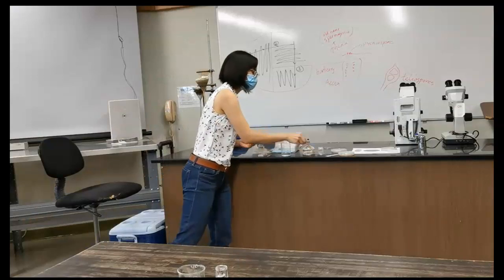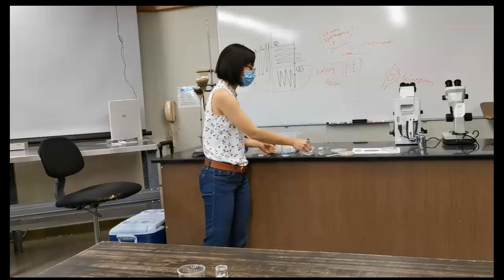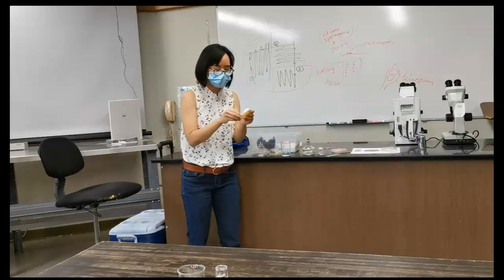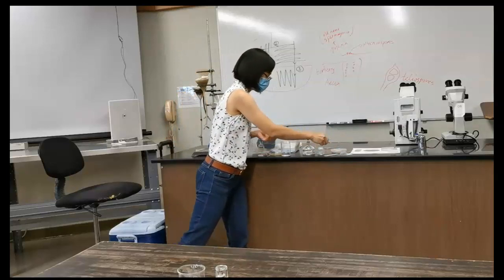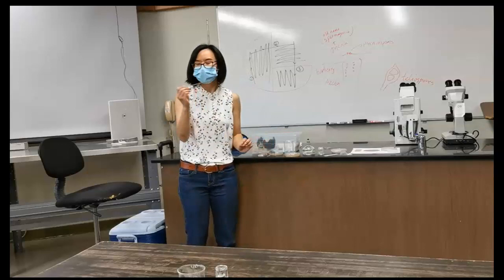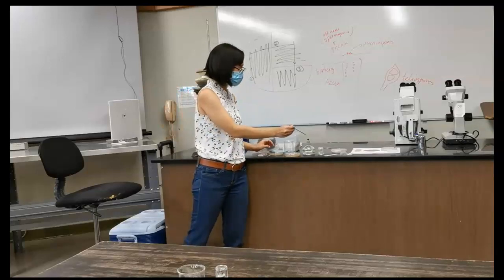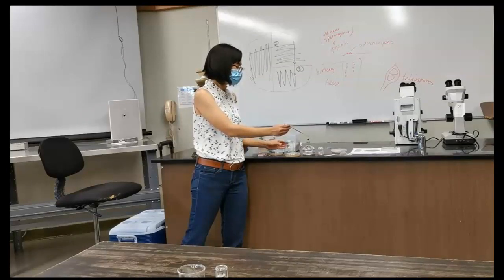So first of all, inoculation loop, I need to clean this. Actually I need to get culture prepared here. Okay, so I will burn the loop. The outer part of the flame has the highest temperature, so I use the outer part of the flame.